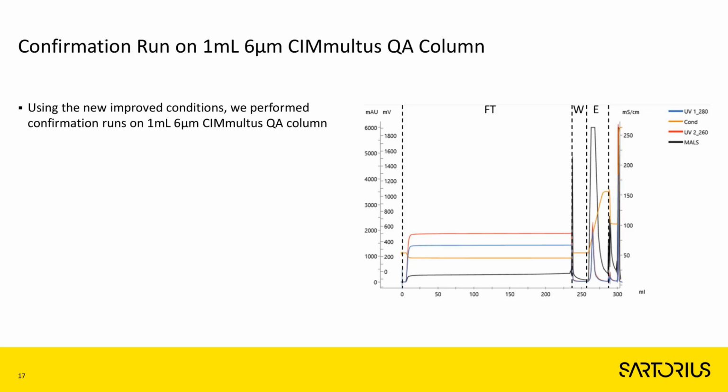We performed this chromatography experiment with conditions that could also be scalable to larger volumes. And if we look at the chromatogram, we can see that the majority of the impurities, or the UV signal that you can see, was in the flow-through, while in the elution, we got a nice single peak where our virus was eluted.